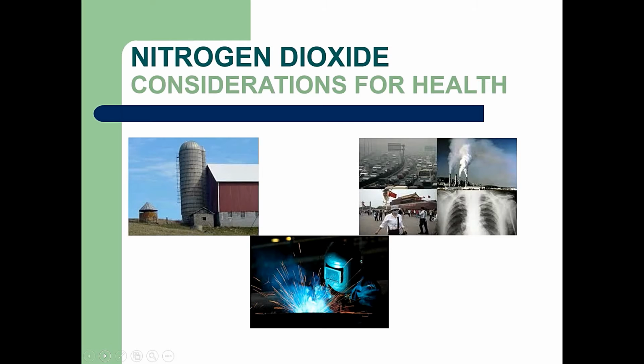Okay, as my final headline today, I will discuss sampling developments for nitrogen dioxide. And you may be thinking, what? Who cares about that chemical? What's newsworthy with that? Well, actually, nitrogen dioxide is a very significant chemical compound since it has both occupational and public health considerations.